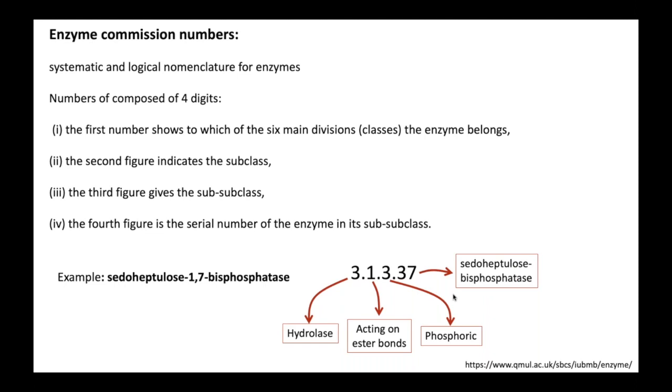But also, you can transfer these by similarity. So you can say, well, if my gene is at least whatever 90% similar to another gene that already has an EC number associated with it, I'm going to just transfer that EC number. So that's very useful when you're trying to do automated whole genome transferring of EC numbers.